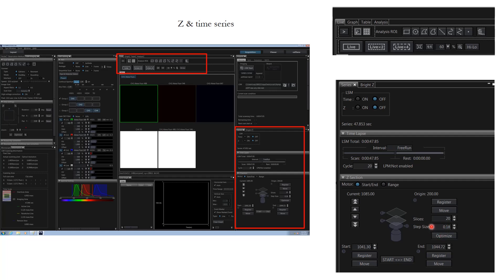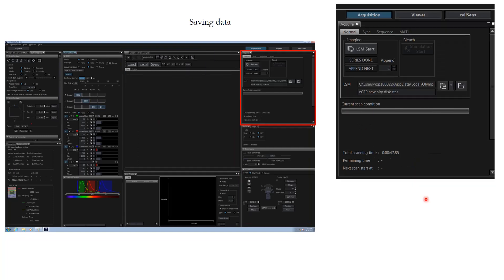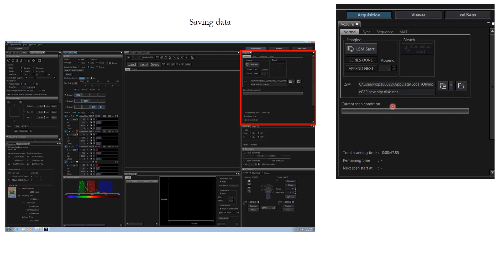Once this is done, you'll be seeing in the next picture that it is giving you overall time required for one image. When you click LSM start, this will give you the remaining time. Further, if you acquired the image and saw that it didn't complete all the images or all the planes that you wanted, you can click append next and it will add more Z slices to it.